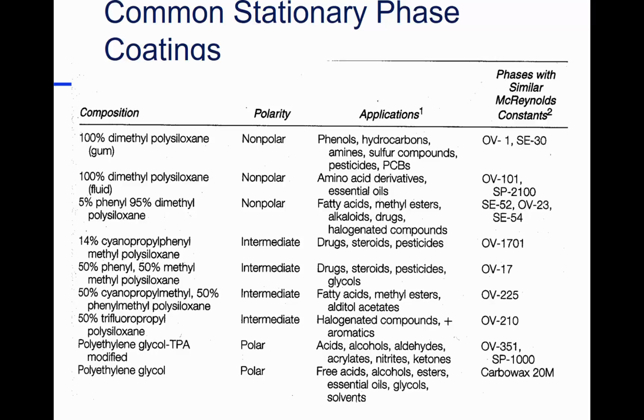So very polar materials. What do we use? If we've got a bunch of nonpolar materials we want to separate by gas chromatography, we use a nonpolar column. We want some interaction between that column and our analytes. If we're analyzing polar materials, then we'll use this kind of a column because it has a strong interaction with polar analytes. And there's a nice range in between. So we put a coating inside, and that's our stationary phase.